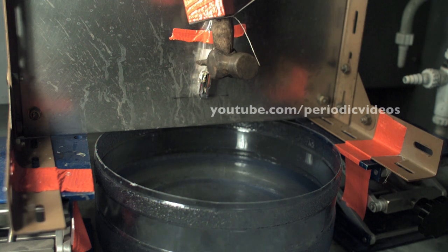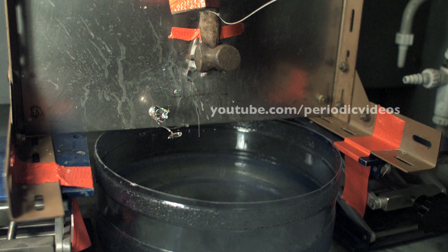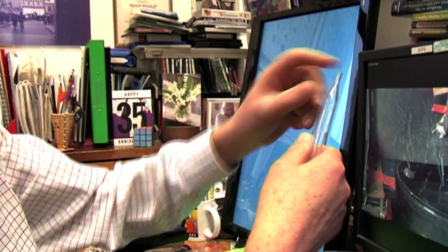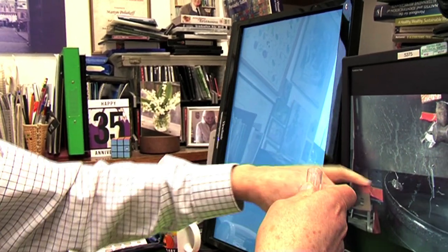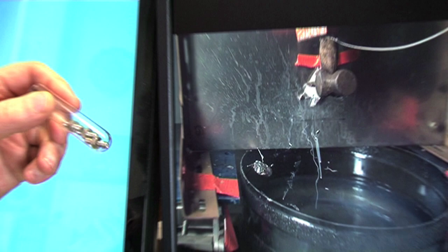The hammer, you'll remember, is our small metallic collider for breaking glass ampoules, and here it's coming, and it hits the ampoule and breaks it. It has broken the ampoule above the metal, so there's a large lump of ampoule falling down with some rubidium inside it.